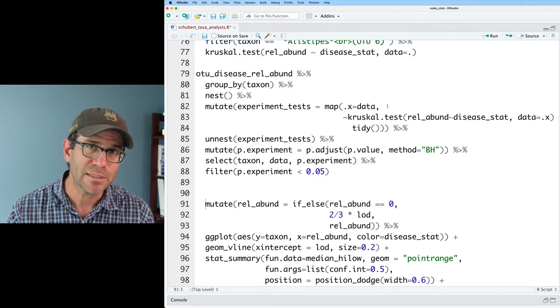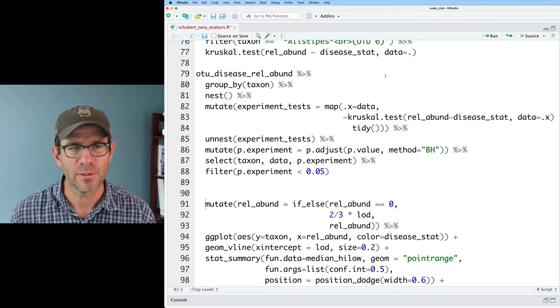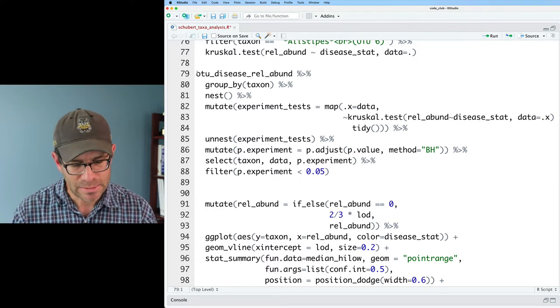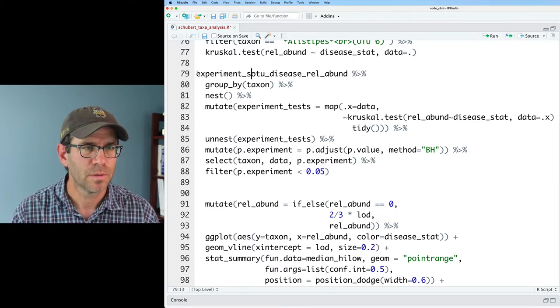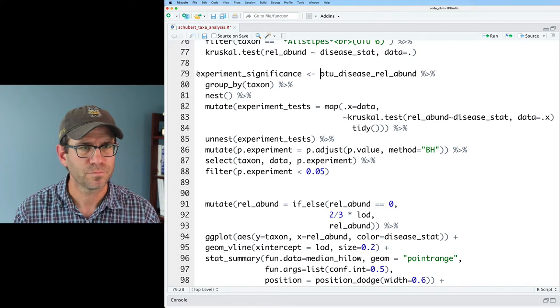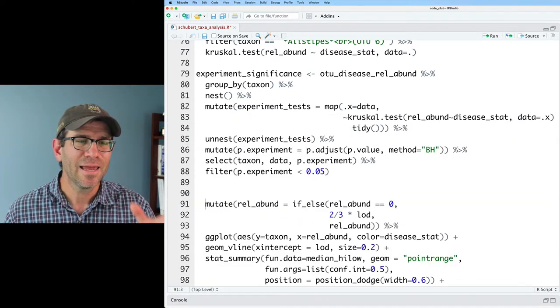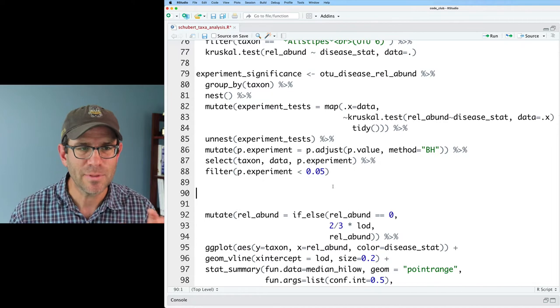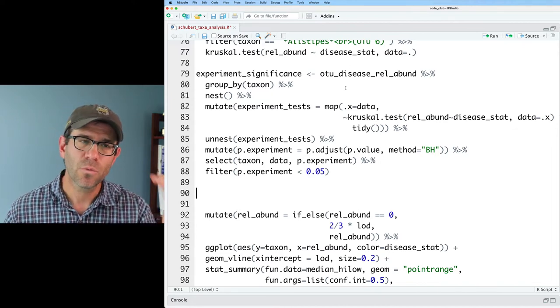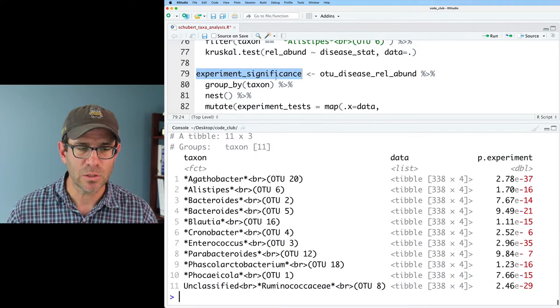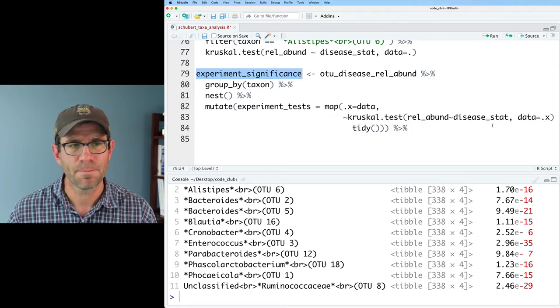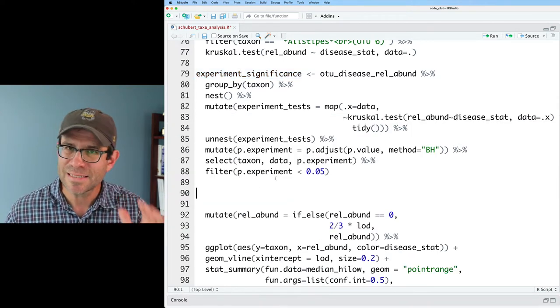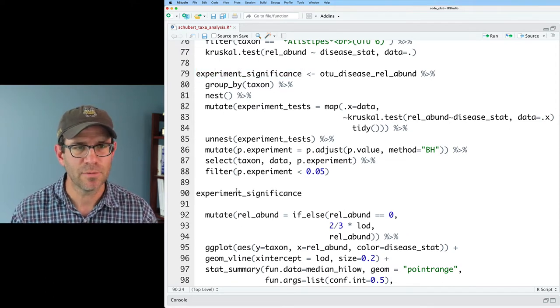Now the question is, of those three different disease status groups, which ones are significantly different from each other? So I could go ahead and save this as experiment significance. We're going to basically repeat what we just did. And instead of experiment significance, we're going to look at the pairwise significance for all of these experiments, or these OTUs rather, that were statistically significant. And so we'll see again that the syntax is very similar. We'll take experiment significance. And we've already got the data nested. So I'm going to do another mutate.